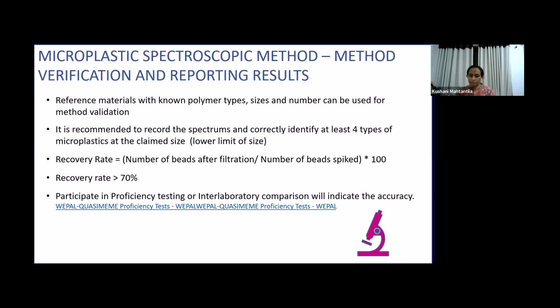During that period, if we are participating in that proficiency testing, we have to analyze and report the results according to their procedure, whether they take the true value, the known value, or the population mean of the laboratories that participate in the program.